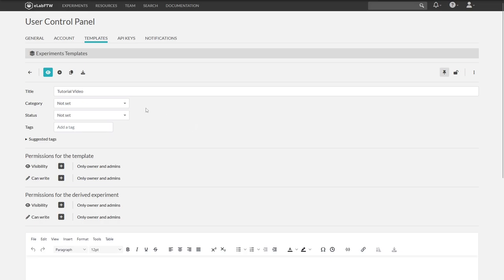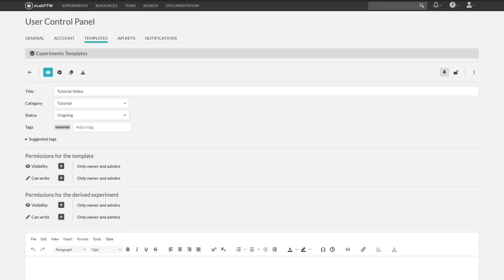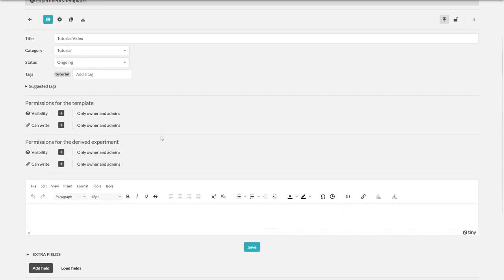Let's choose a category, status and a tag. In the next step there is already an addition. You can define permissions for the template. Who can see this template and who can edit it.